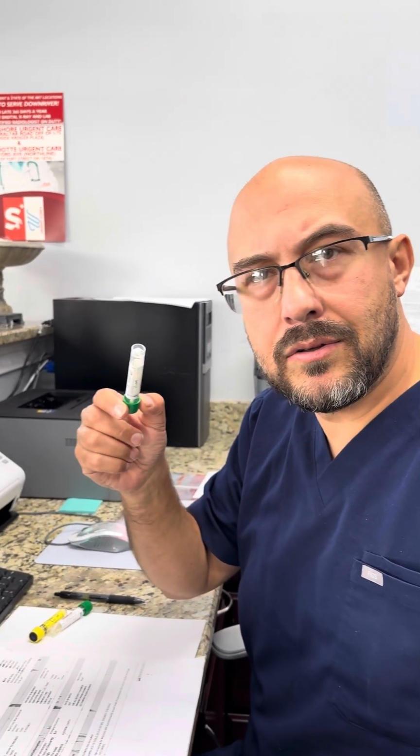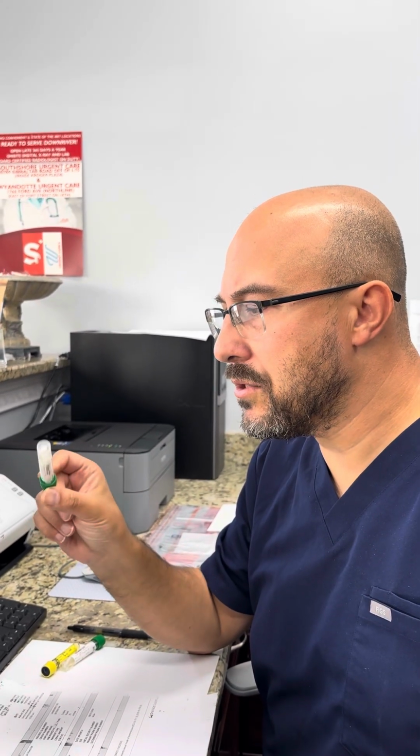So I'm gonna make a video on Orchard, two videos actually. The first one is how to input all the information. The second video will be about how to check on the results and follow up with patients. The first video here will be covering how to put in the vitals. I'm sorry, not the vitals, but the viral tubes for COVID, flu, RSV, and whatnot.